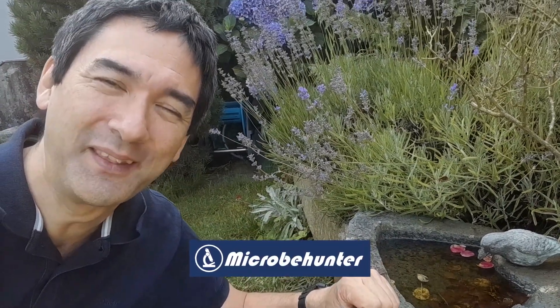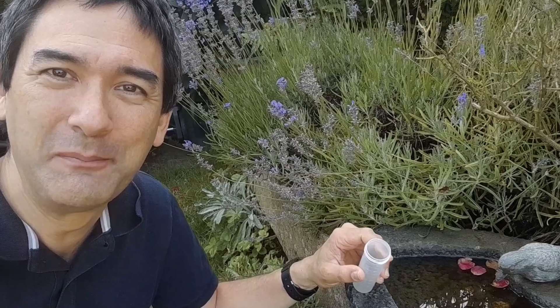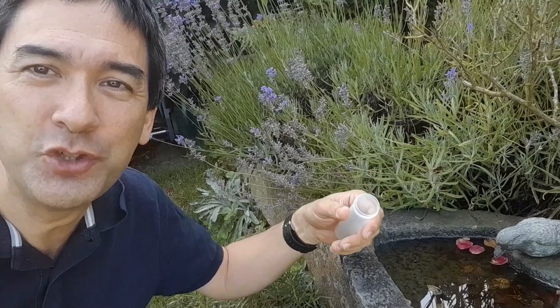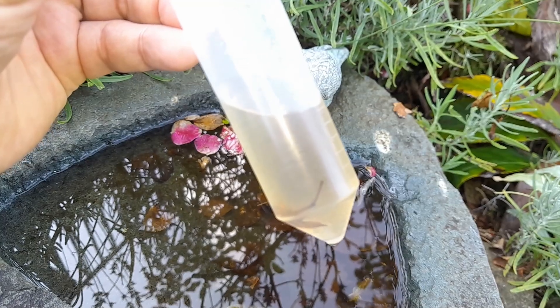It's time again to do a little bit of water microscopy. This is a bird bath, and I'm going to put it under the microscope. Hi, hello and welcome — Microbe Hunter here. Last time I put a sample of this water under the microscope, I found many rotifers, so I'm going to see if I'll be successful again today. I forgot my pipette, so I have to agitate the water a little bit by pouring some in near the bottom. Doesn't it look beautiful? Very green, a lot of sediment — I'm quite sure there's going to be something interesting in here.